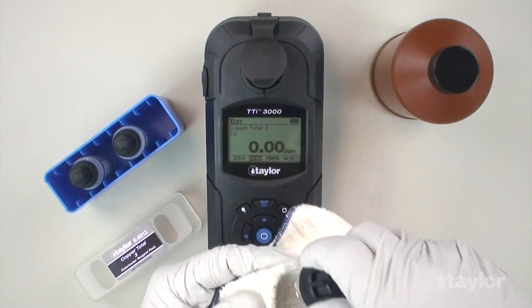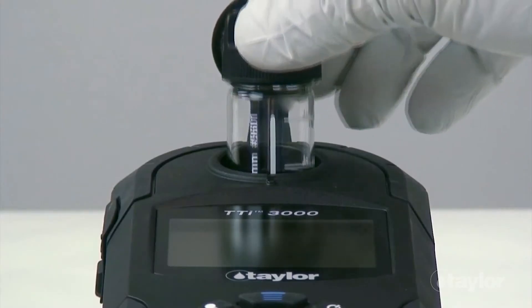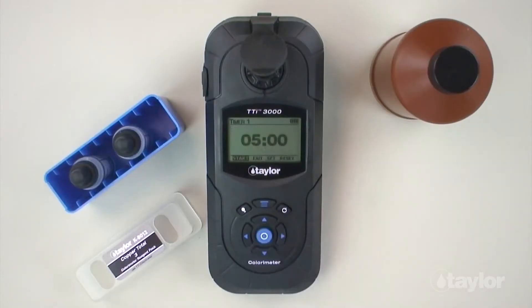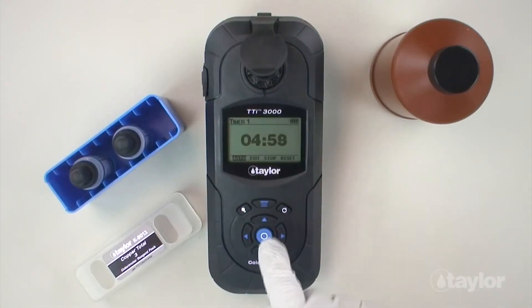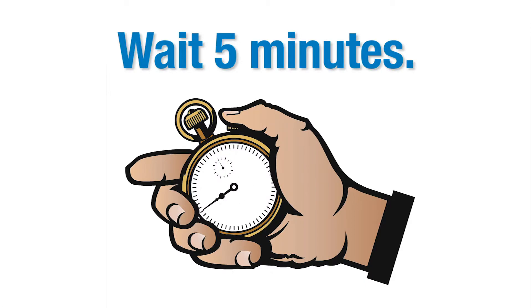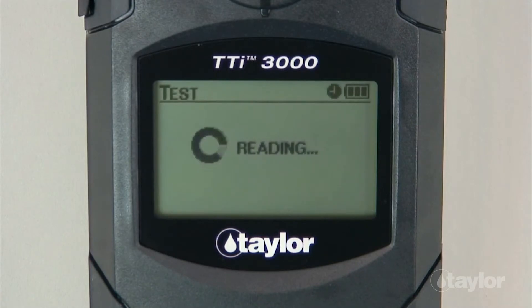Insert the sample cell into the sample cell compartment. Select Timer using the scroll arrows, then press Enter. Select Start, and then press Enter. A 5-minute countdown will begin. Immediately select Auto, and then press Enter. When the timer beeps, the instrument will read the sample, and the result will be displayed.